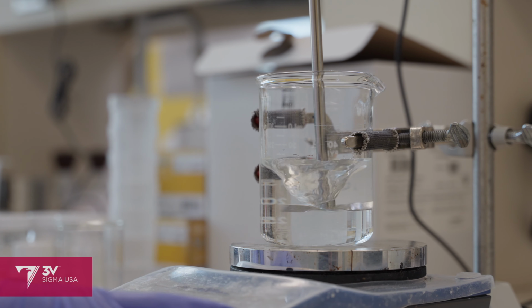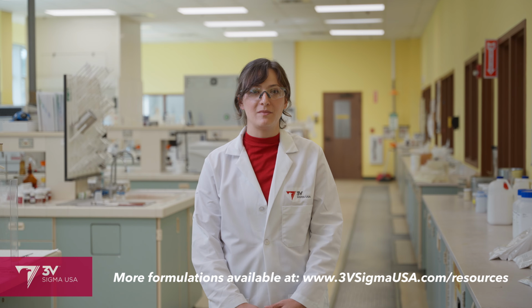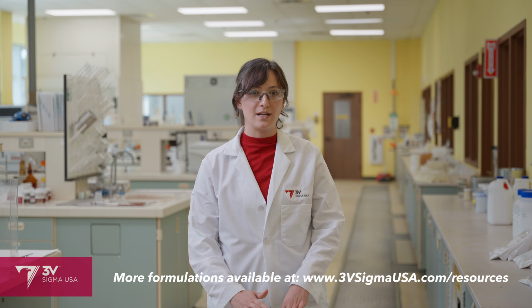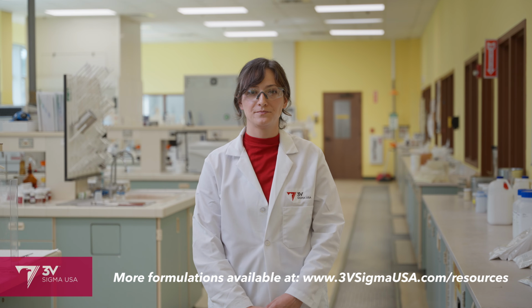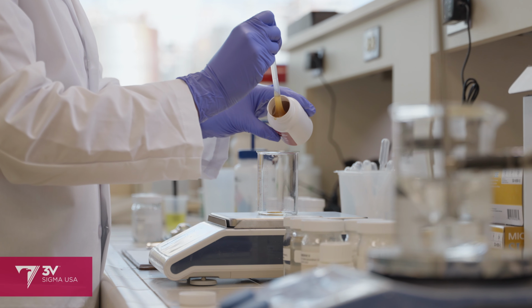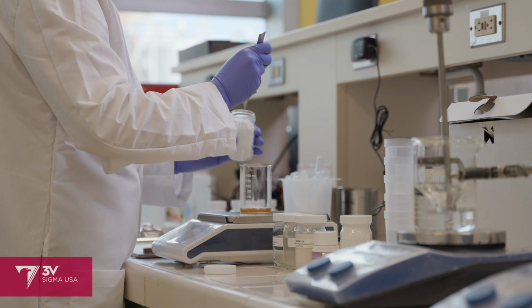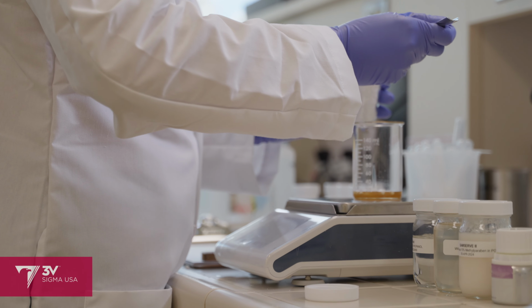I'm using Emulsiderm MPN, which is our liquid, cold process compatible, 100% naturally derived emulsifier, alongside glycerol laurate. The two of these together are very mild on the skin and will not have that whitening or soaping effect when it's rubbed in. A little bit of cetyl alcohol will thicken the consistency of the lotion.